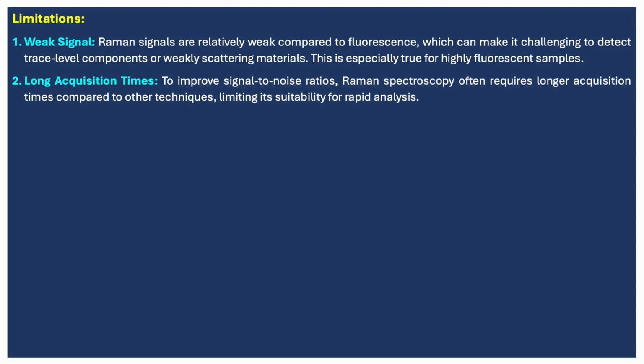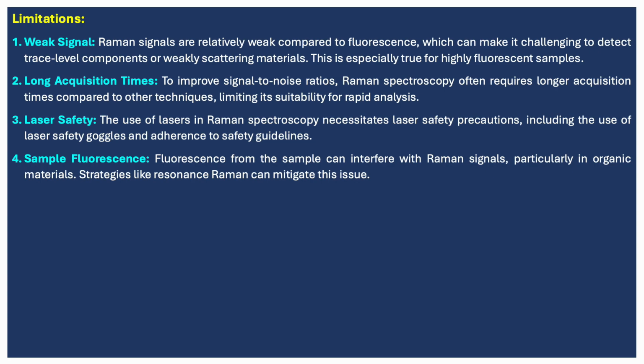And to improve the signal to noise ratio, Raman spectroscopy often requires longer acquisition time compared to other techniques, limiting its suitability for rapid analysis. The use of lasers in Raman spectroscopy necessitates laser safety precautions, including the use of laser safety goggles and adherence to the safety guidelines.